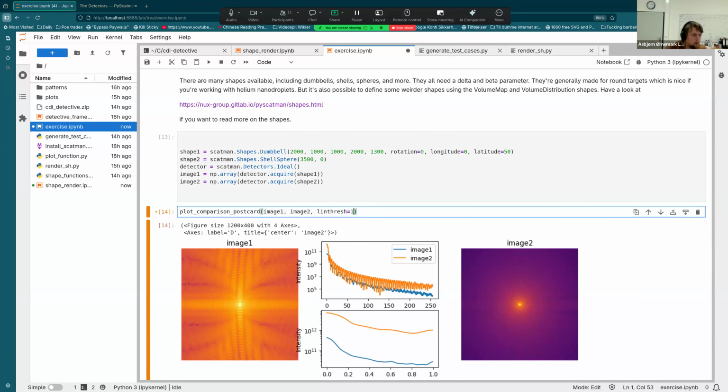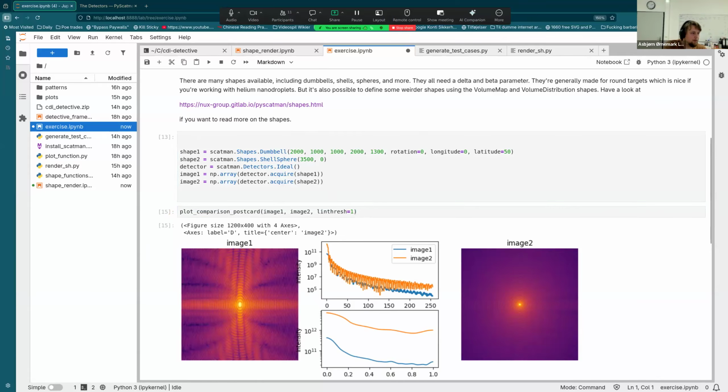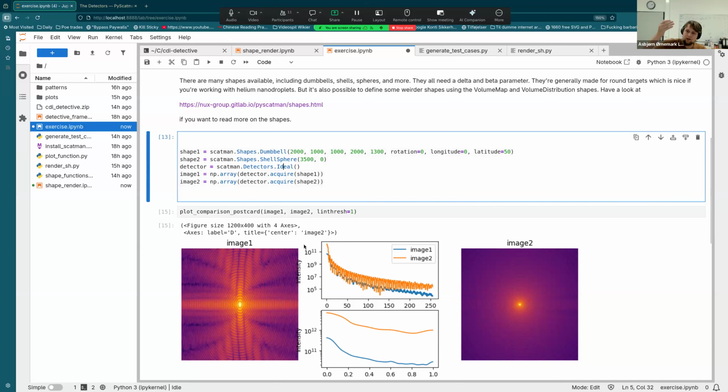Yes. If we swap to ideal, then it changes from being in units of, anyways, MSFT is just whatever the output is, but to this ideal you then add, okay, each pixel has a Poissonian chance of getting a photon, and that means there's going to be some noise out at the edges. Somehow it's not present here, which I don't understand.